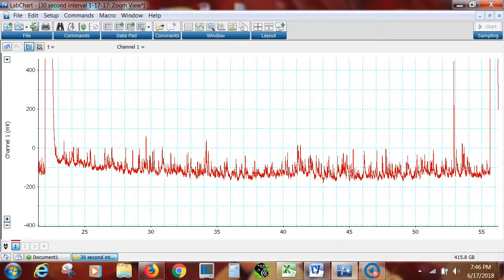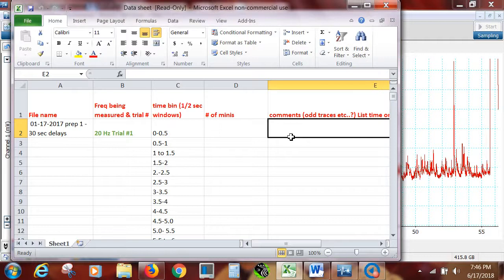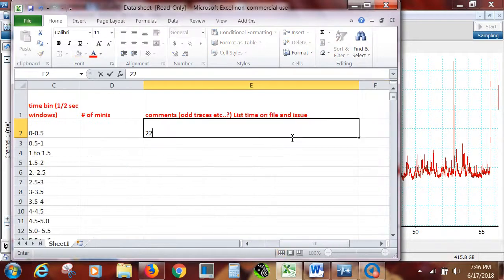Okay. So I could go over here and say the beginning of 0 will be 22.9876. You know, maybe it's better just to start at 23. I don't know. So let's see how far that would be. Maybe it'll be easier for us to do this.